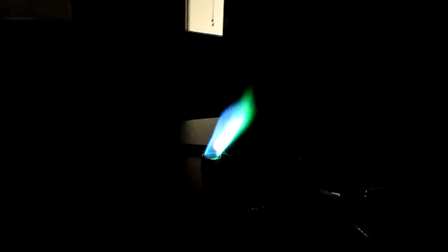And our final solution, which already gives its color away because the solution is a blue-green color. Okay. So that's copper. There it is.